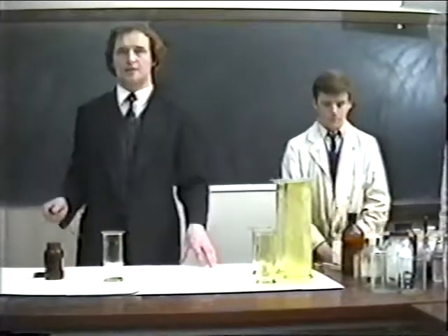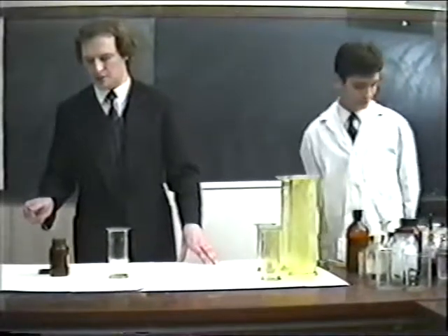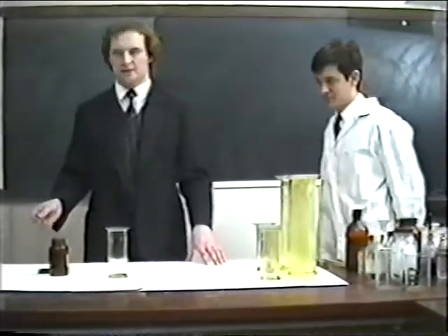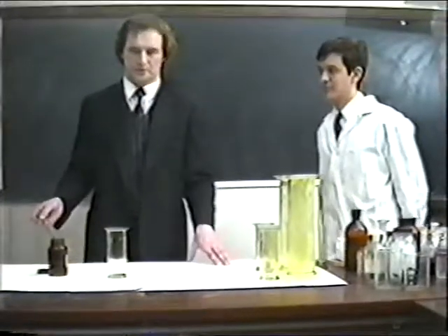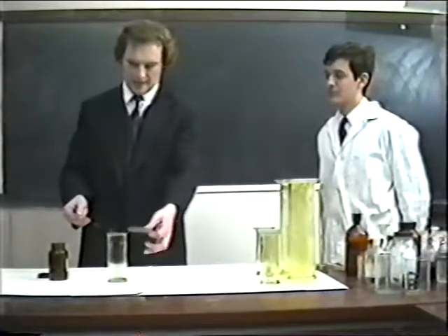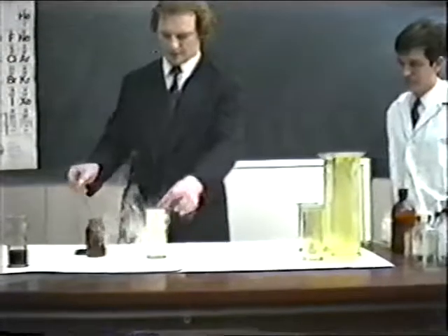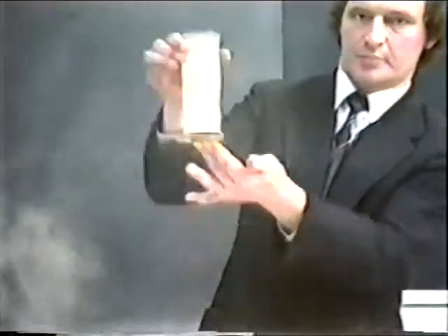And he used to attempt to cure people with antimony because it was known that antimony could purify gold very well. And he reasoned that if antimony can purify gold, then it can also purify people. Regrettably, most of his patients died. Now I will pour some antimony there, and as you can see, as I pour it into the chlorine, there is sparking going on because the antimony is combining directly with the chlorine to make antimony trichloride. Another example of a synthesis reaction.